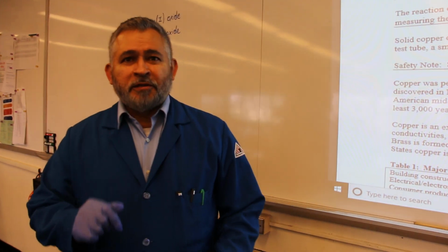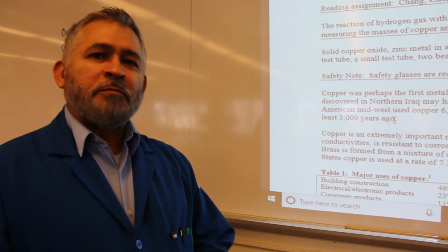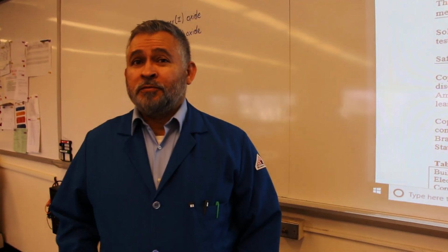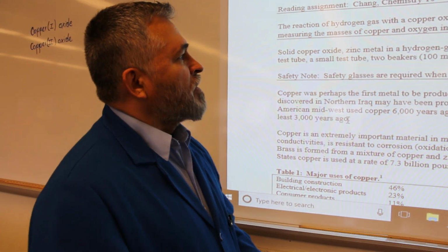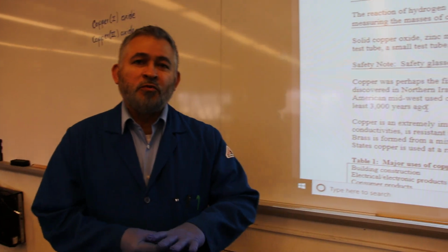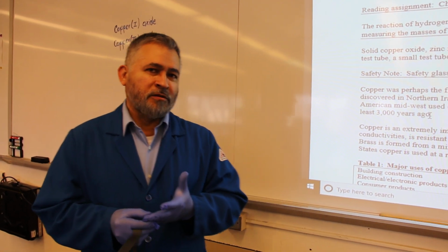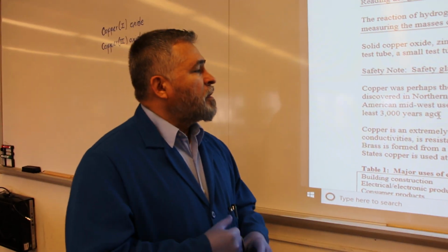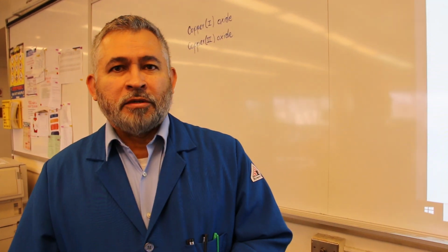Let's talk about safety before we continue. What are the safety precautions for this lab? We need to wear safety goggles, like those. Also, we need to wear gloves. I'm wearing nitrile gloves now. And just follow the instructions.